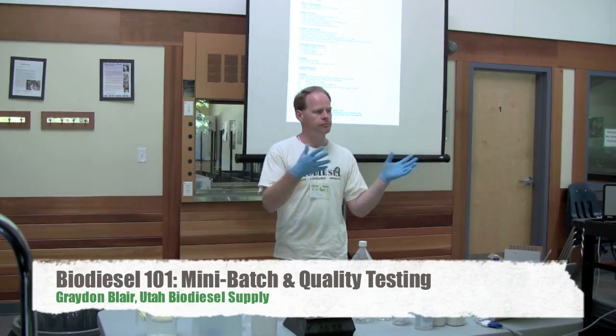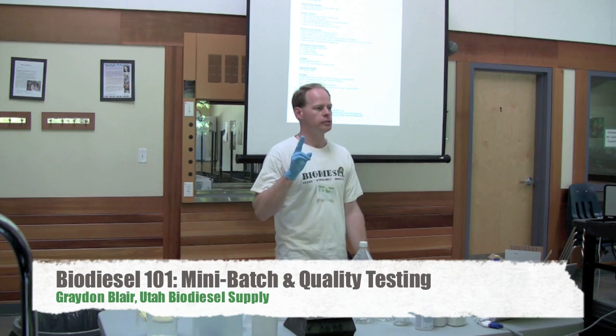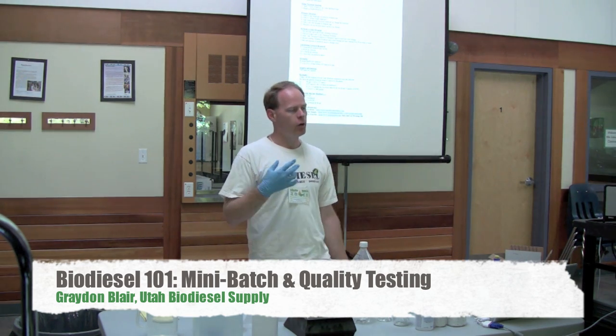Also, I am one of the organizers of past conferences, and today we're going to make some biodiesel. We're also going to do some titrating of oil, and then we're going to talk about quality tests.